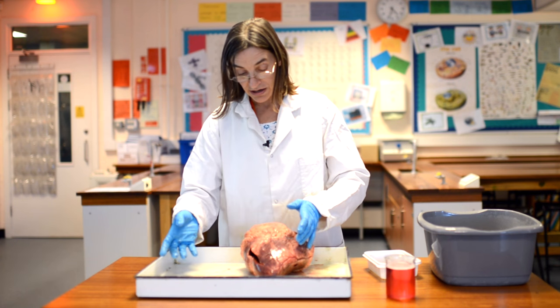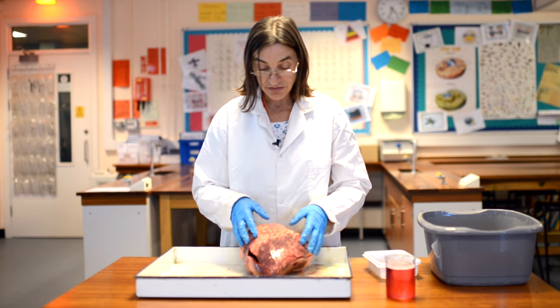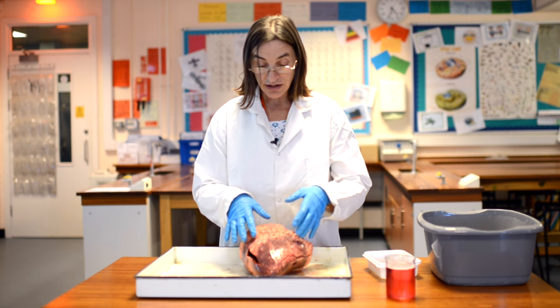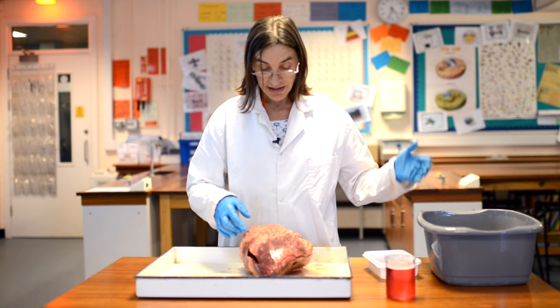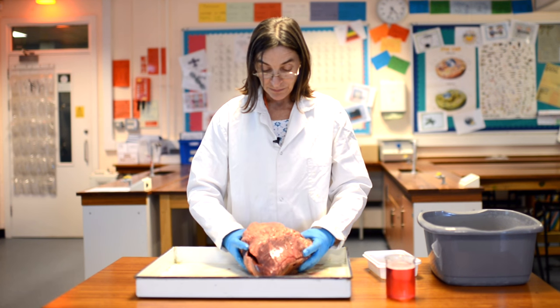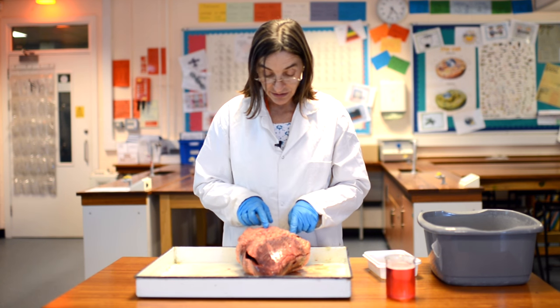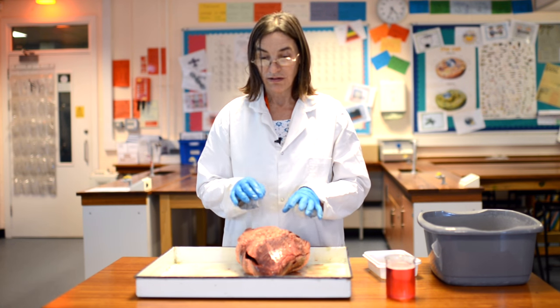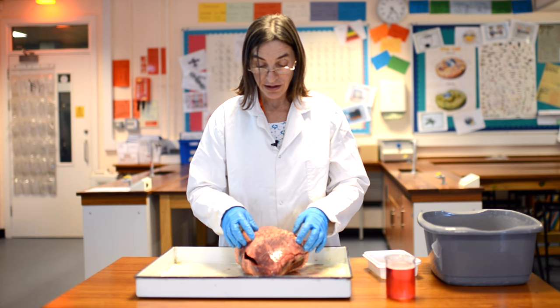So left, right. That's something that people find very confusing when they look at pictures of the heart in books or actually look at the heart. You need to imagine that it's actually inside you. Left, right. Now, first thing you might notice, if we look at the outside before we go any further, is that this was a very well-fed cow, and there is a lot of fat around the heart.